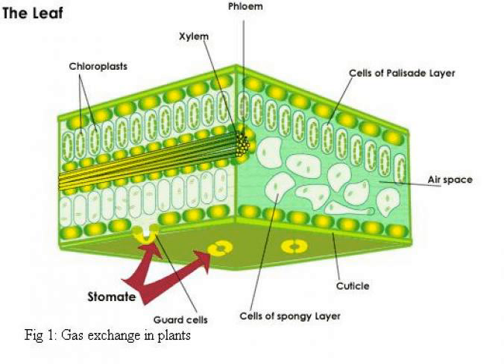4. Allow the fingernail polish to dry completely. Then apply a second coat if needed. 5. Firmly press a short strip of clear tape over the dried nail polish on the bottom of the leaf. Carefully peel the tape from the leaf and affix it lengthwise to a clean microscope slide. Use a pen to label the slide with the plant name and bottom.